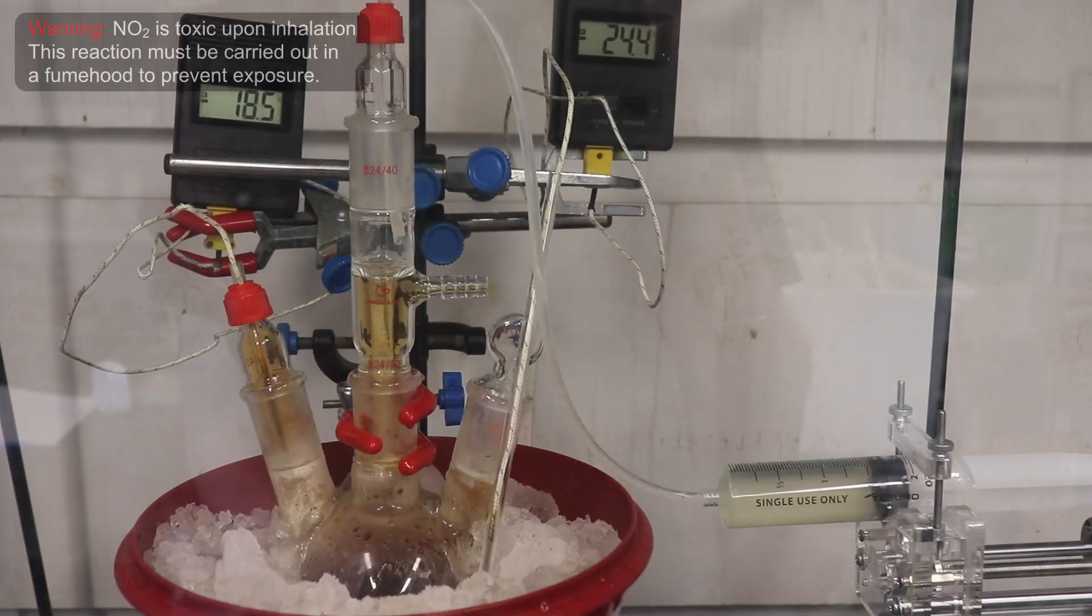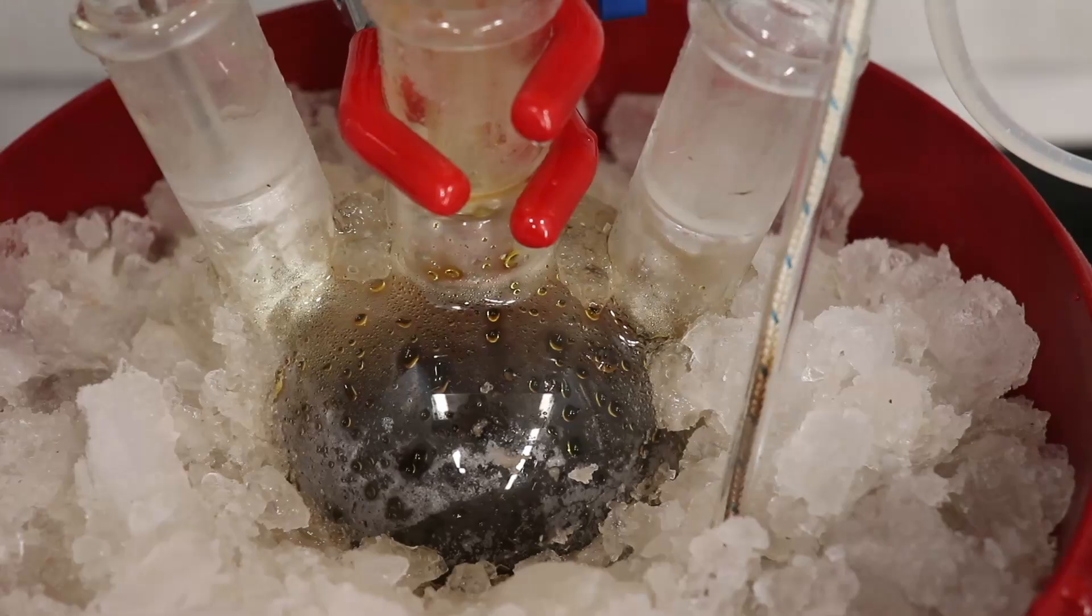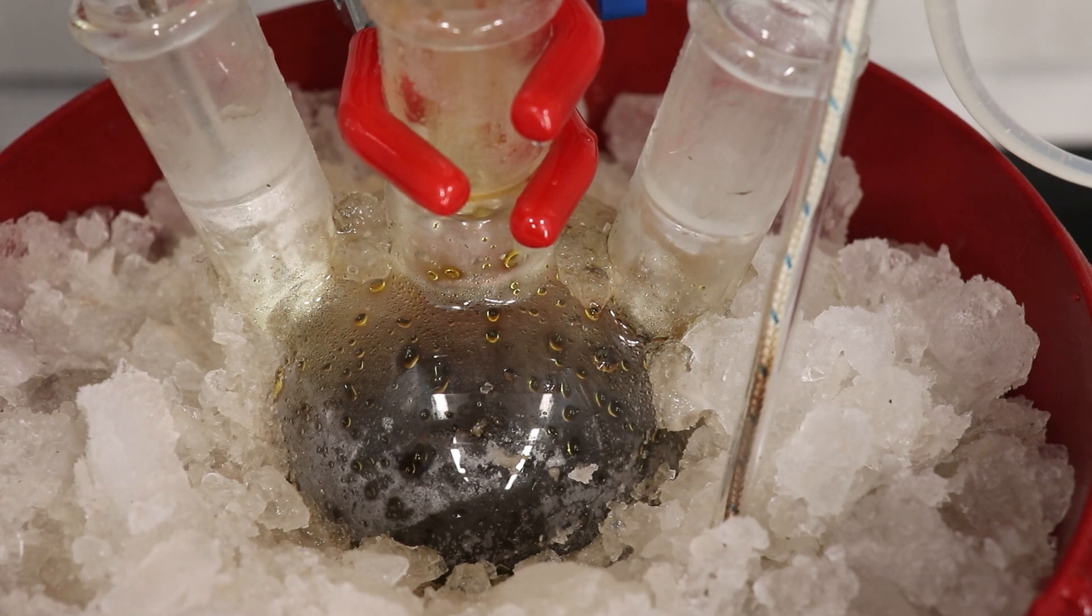At times, a stream of nitrogen dioxide gas can be seen escaping from the flask, and so using a fume hood for this reaction is essential. Also, the contents of the flask are nearly black due to the copious amounts of nitrogen dioxide dissolved in solution.